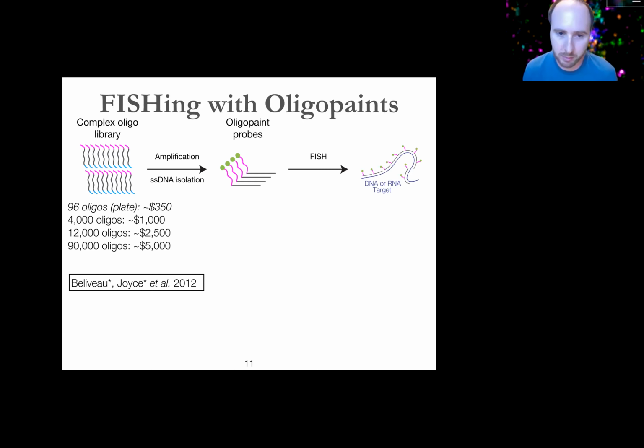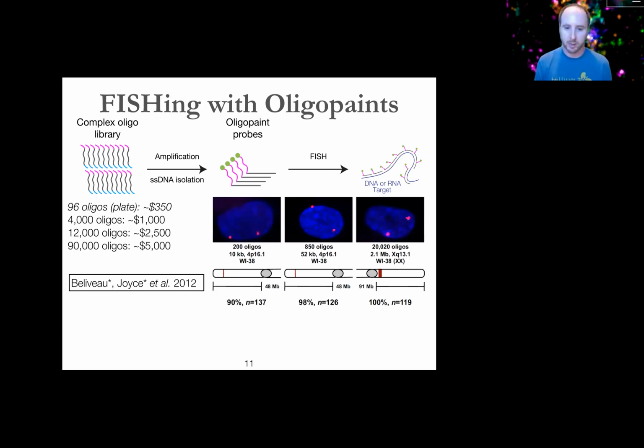And that's where we started when we were developing Oligopaints about a decade ago, was kind of figuring out a process by which we could, for instance, put primer pairs around these sequences that are going to target the FISH probes and to efficiently make these in bulk to the scale of like picomoles or so, which is what you need to do a FISH assay. And then we can apply them to try to target a given stretch of chromosome or messenger RNA. And the good news is that this works really well.